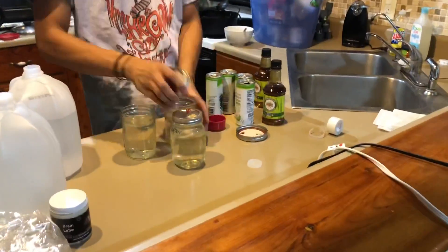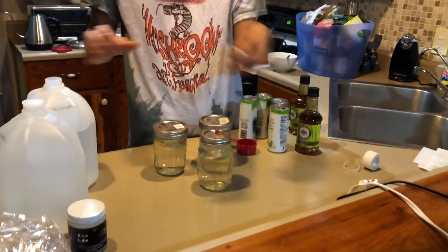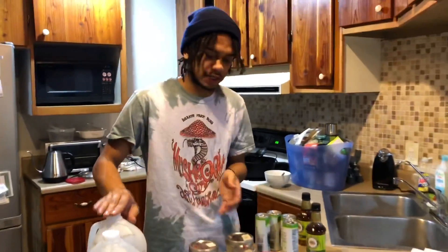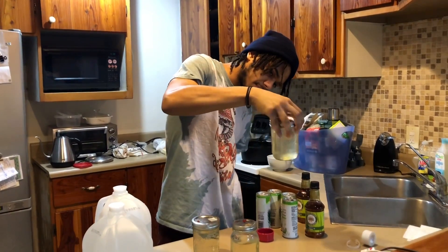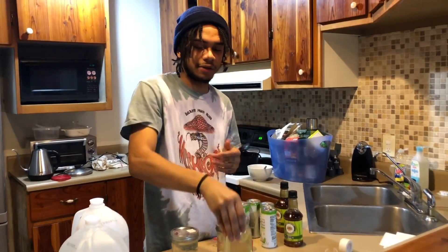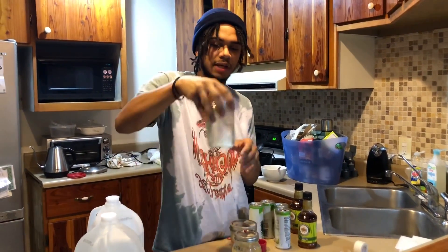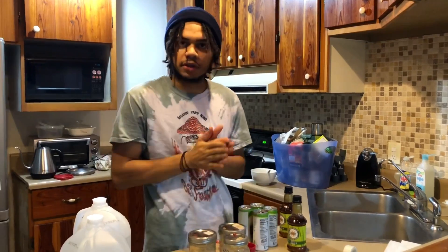Now we're going to put the lids on and then put these in the pressure cooker at 10 PSI for 30 minutes. That's all we really need to sterilize our liquids. We don't want the sugars to caramelize at all — just mix it up and make sure everything gets stirred around. You don't want the pressure to get too high or run too long, because then it'll caramelize and you'll end up with a darker liquid culture.